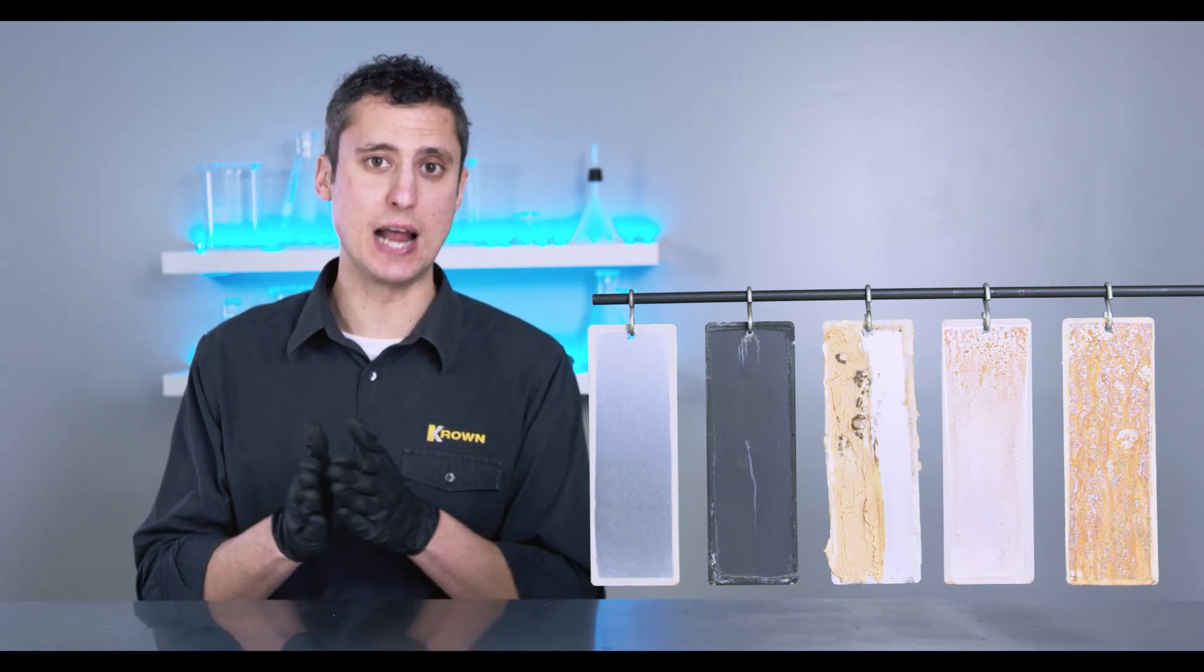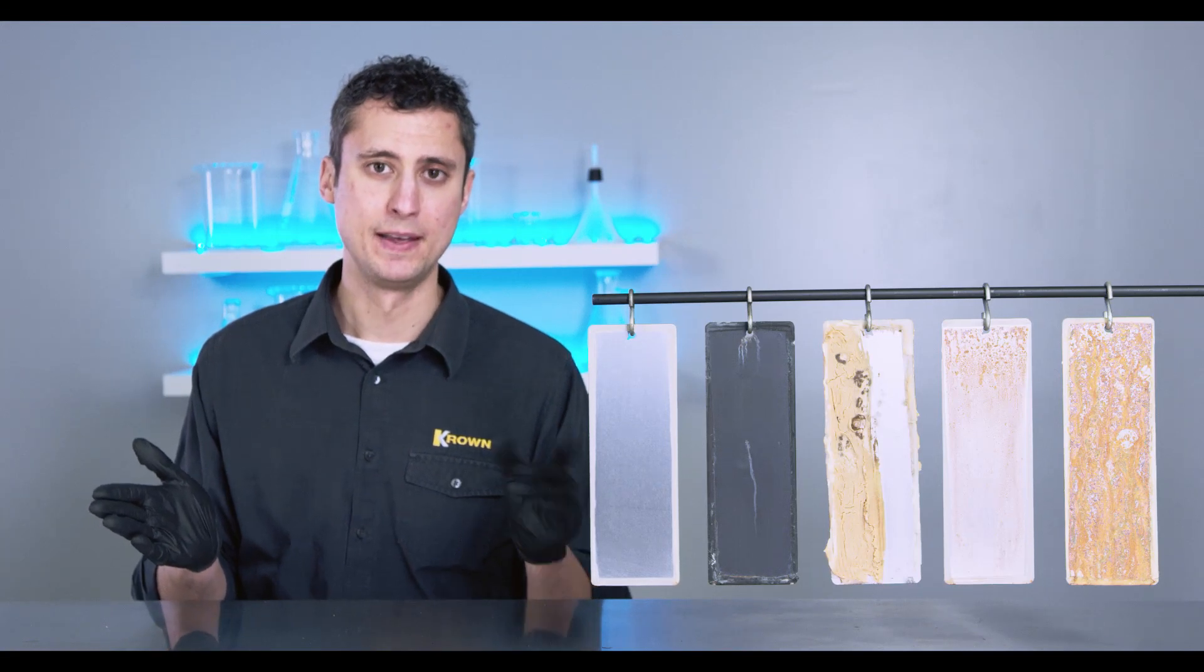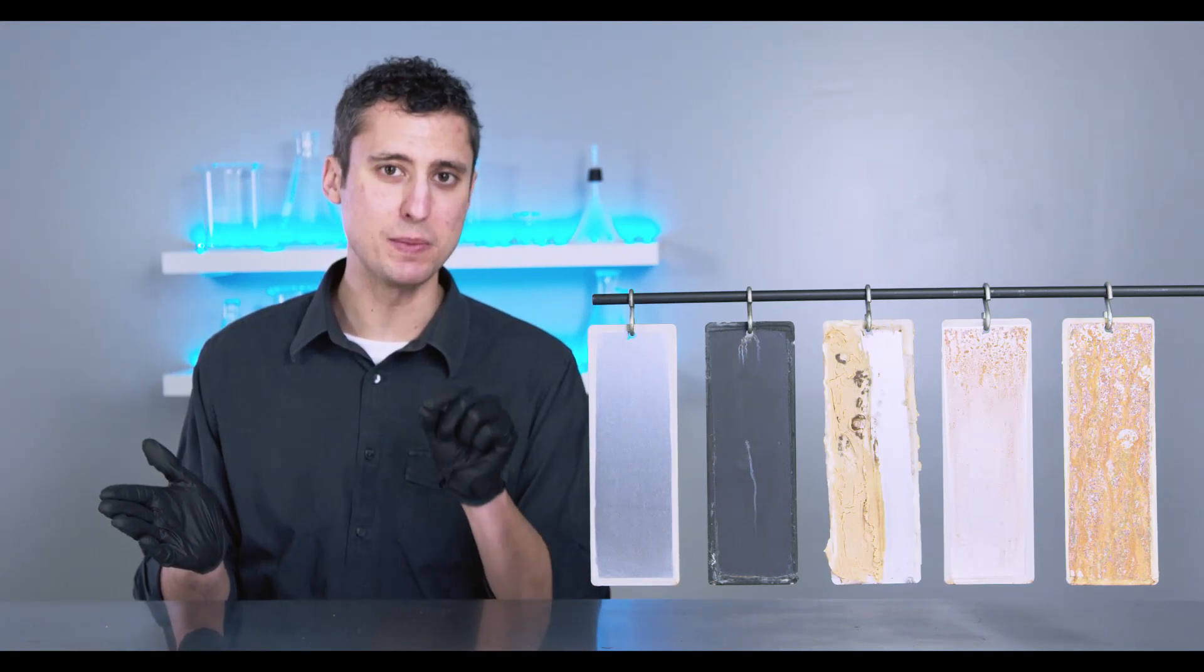Obviously after seeing this test, you're not going to take peanut butter and try to coat the underneath of your vehicle with it. Now we're going to come back to that point because it's very important.